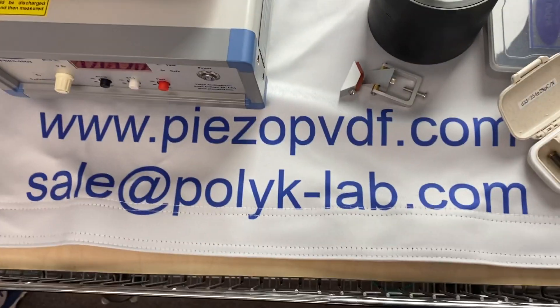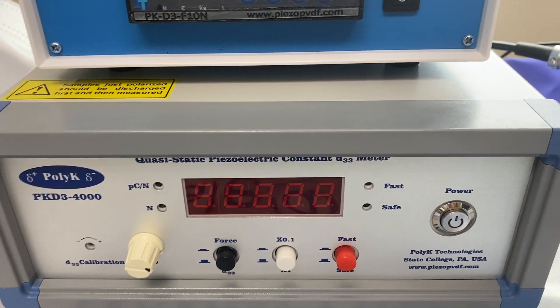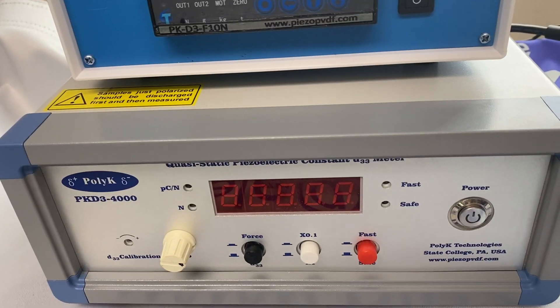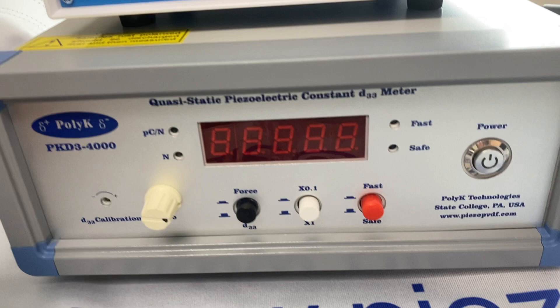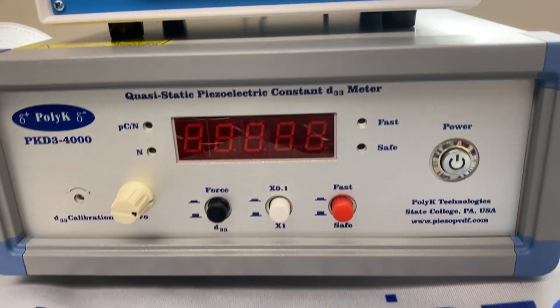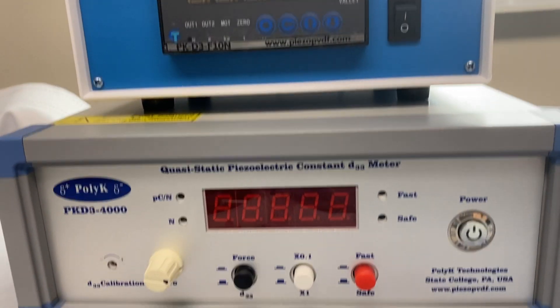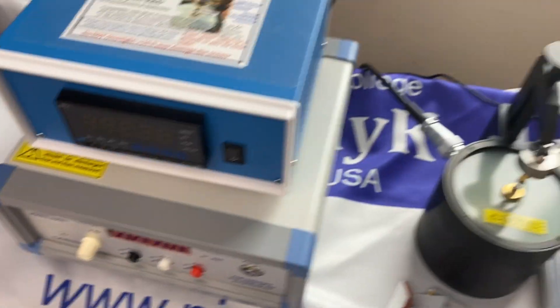Good morning. This is the Polikey PKD3-4000PETO D33 meter, used to measure the D33 of ceramic, single crystal, and polymer materials. This meter can measure up to 4,000 picocoulombs per newton, which is very important because if you are working on single crystal PMN-PT, that can have D33 over 2,000. So this is a very good meter, and the connection is quite simple.